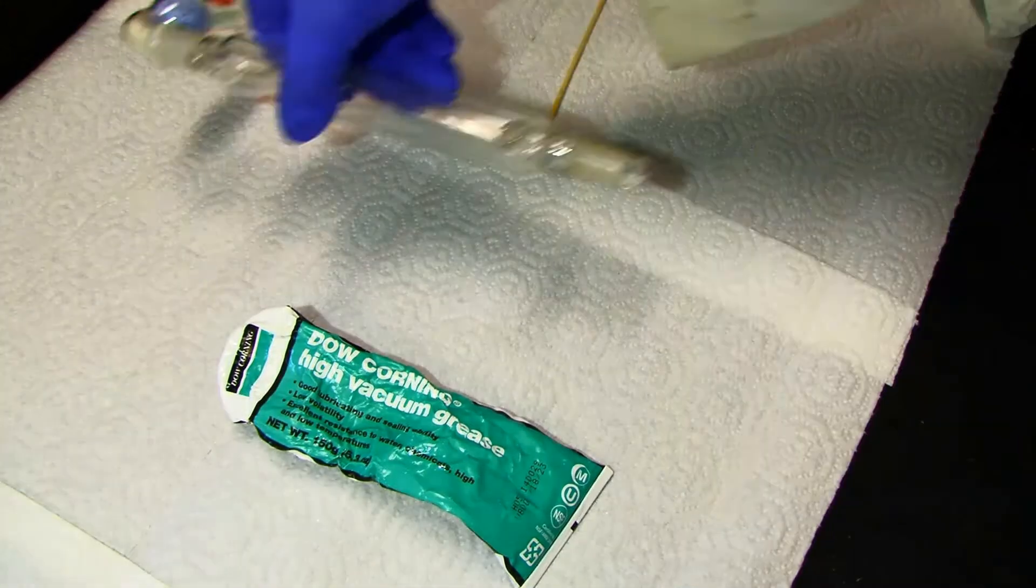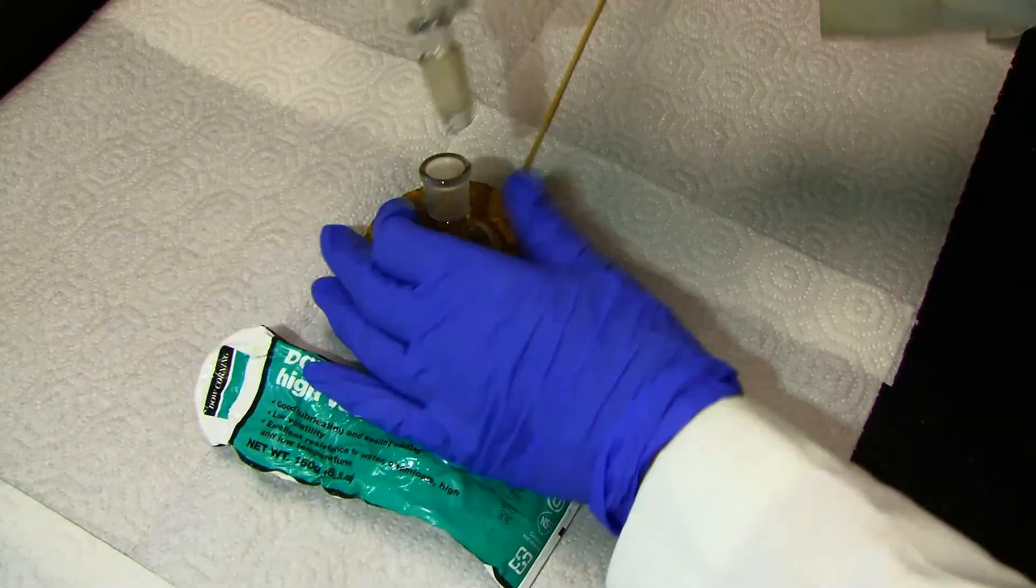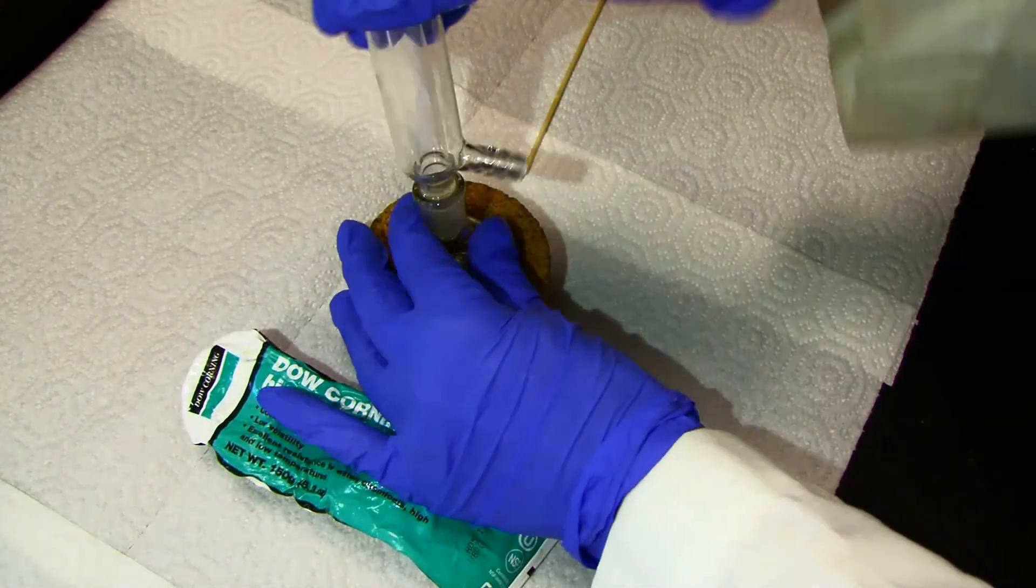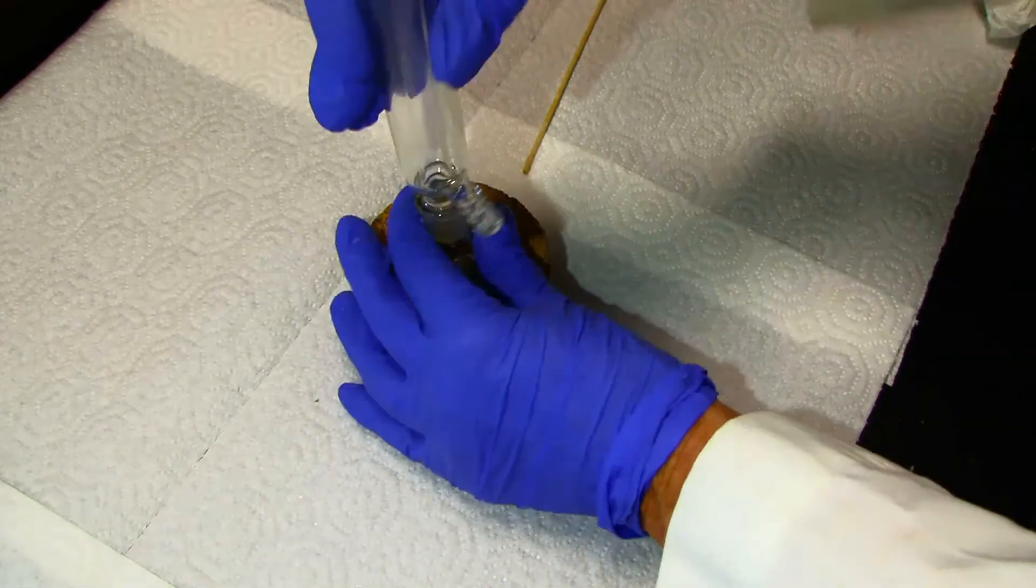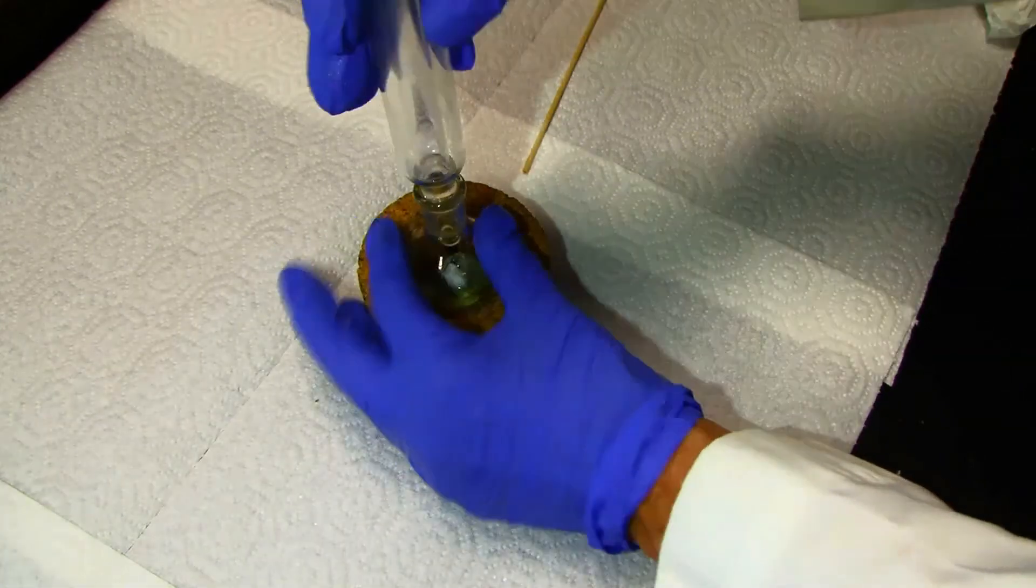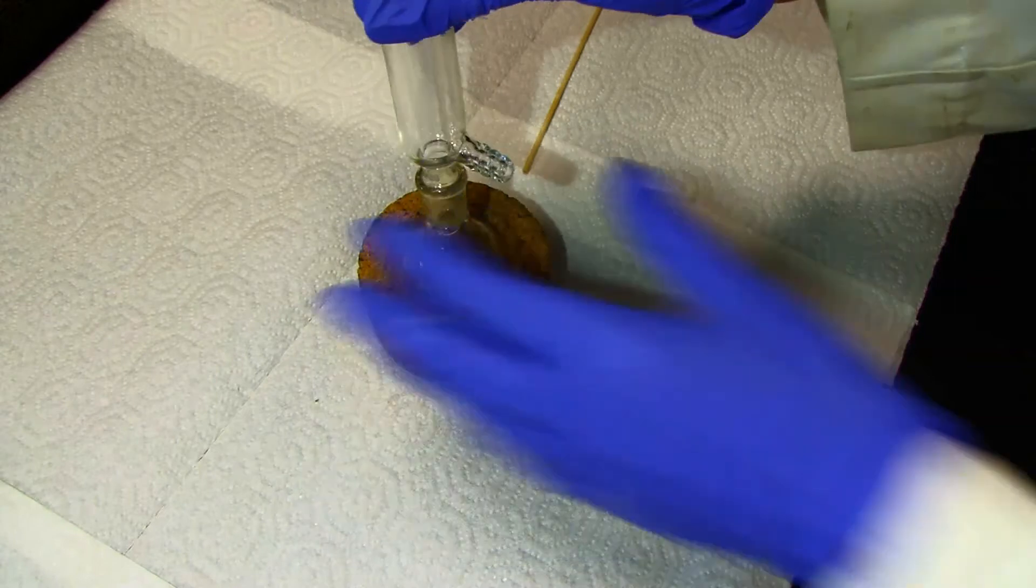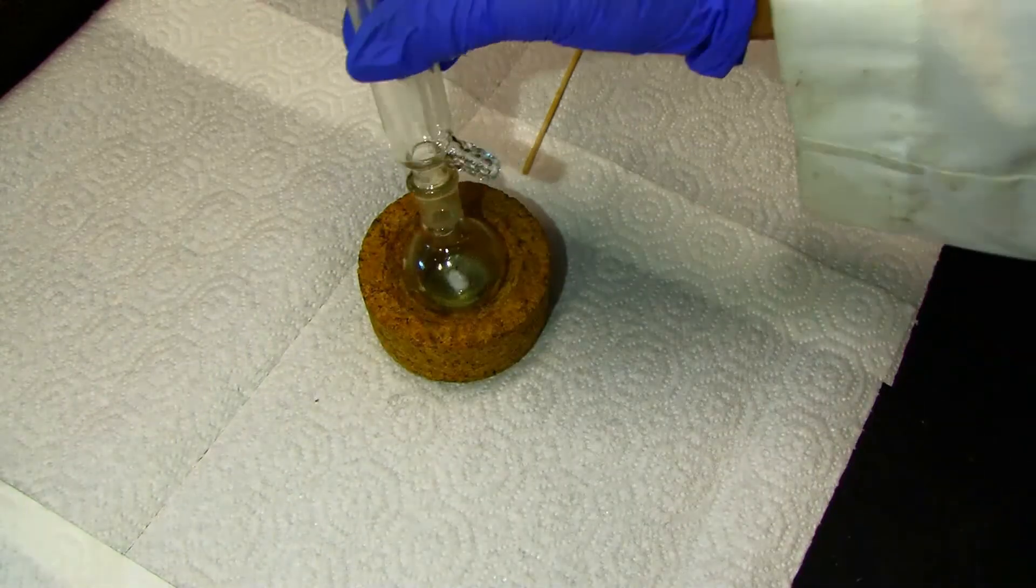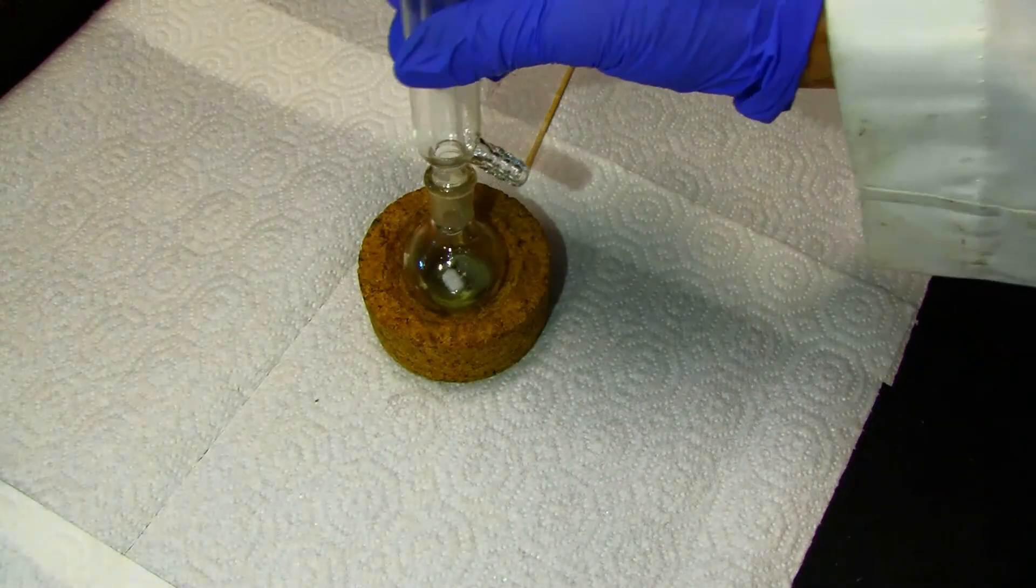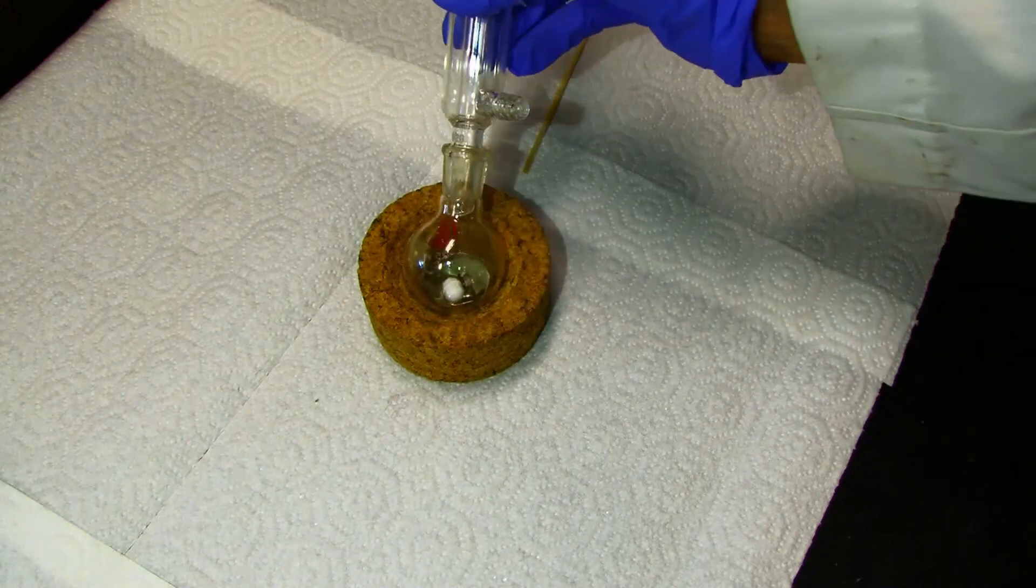And then you take the flask, put the condenser on it, and twist. You should see that now, instead of having the joint be opaque, it is quite clear.